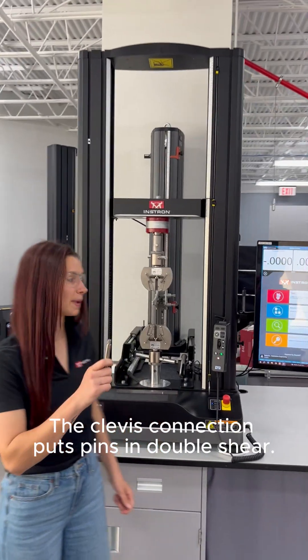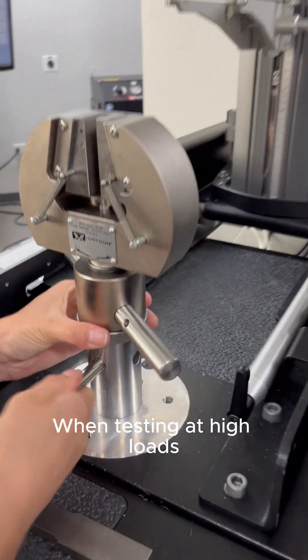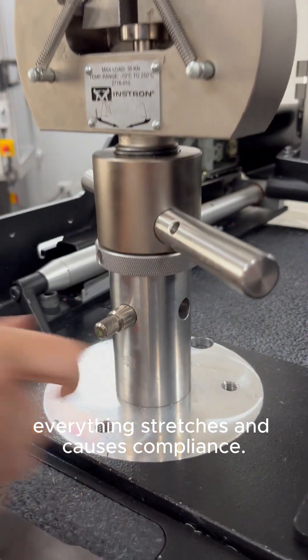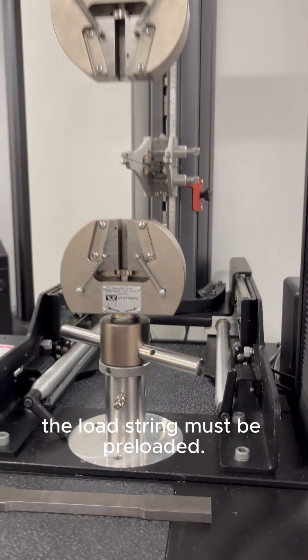The clevis connection puts pins in double shear. When testing at high loads, everything stretches and causes compliance. To remove the compliance, the load string must be preloaded.